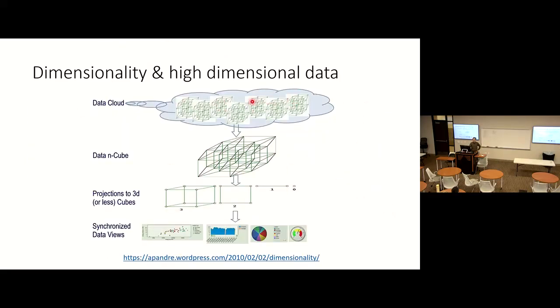So our data looks like this. In single cell, each sample contains many cells, and each cell is defined by many dimensions. So you have multiple high-dimensional data sets in the cloud, and then you want to reduce the dimension to do visualization, to compare, to do the downstream analysis. So this technique is essential here.